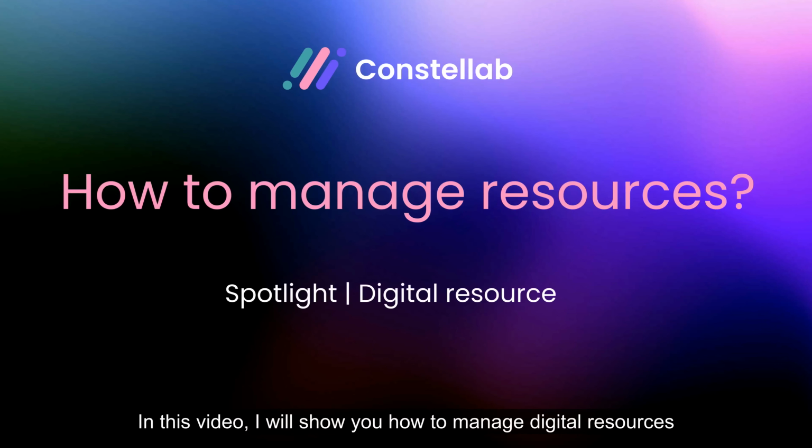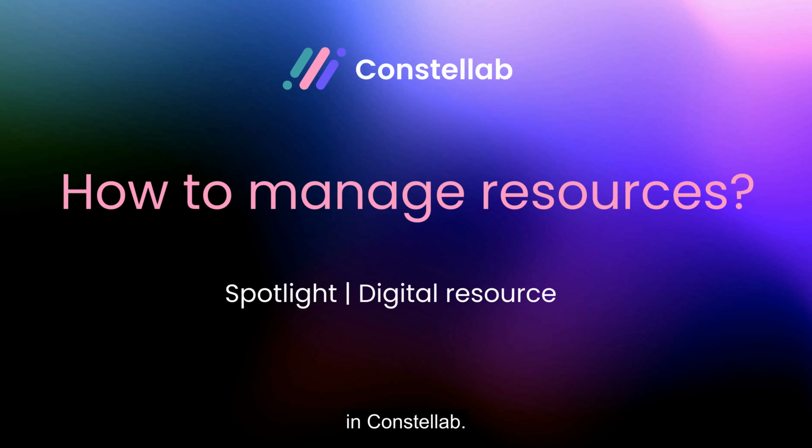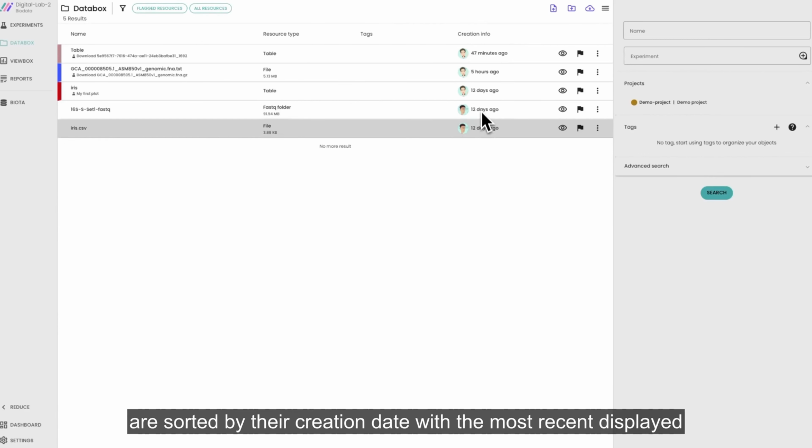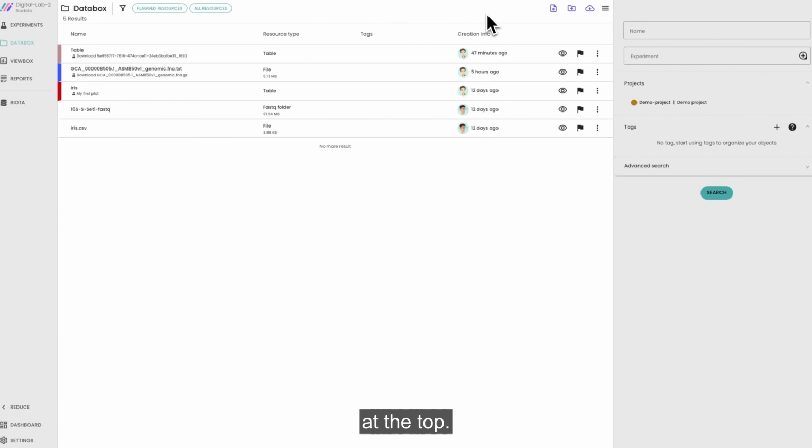In this video, I will show you how to manage digital resources in Constellab. Through the data box, you access all digital resources that are sorted by their creation date with the most recent displayed at the top.